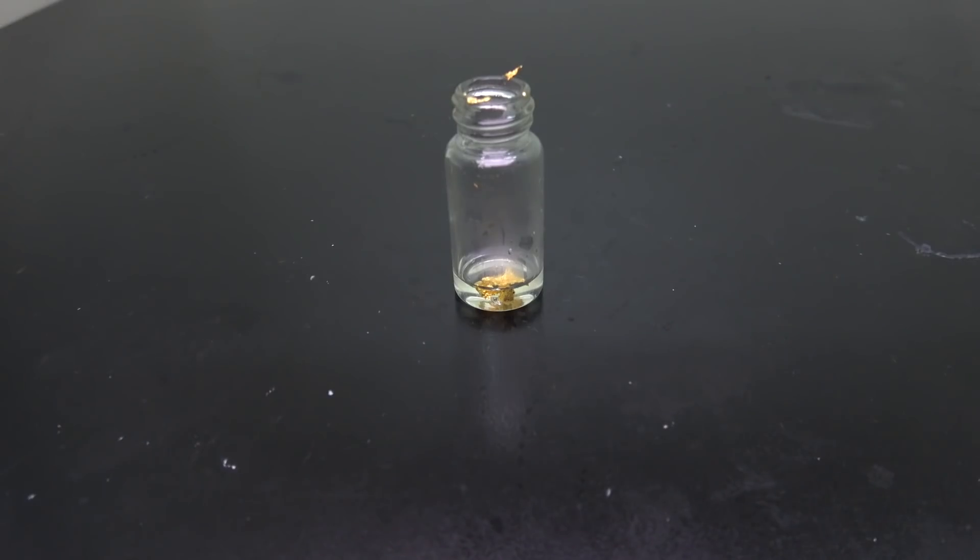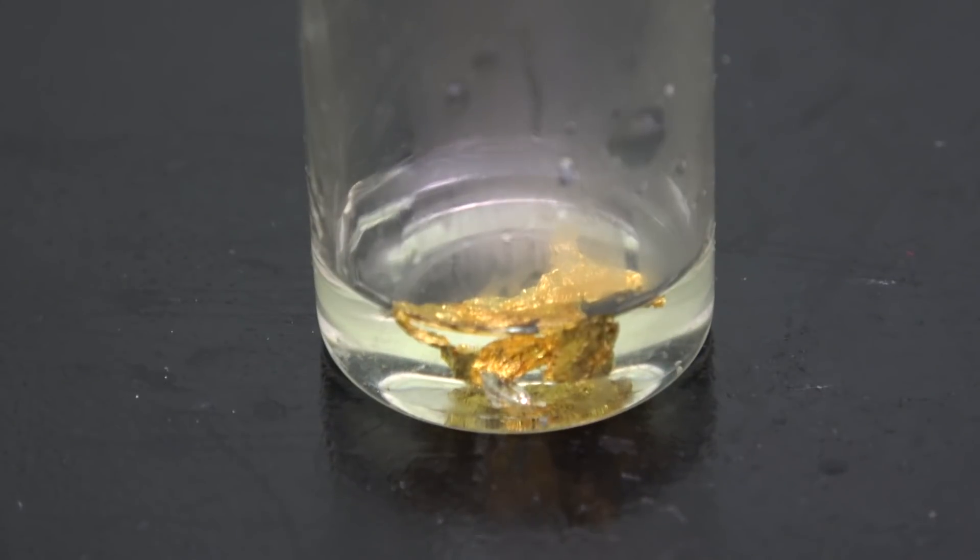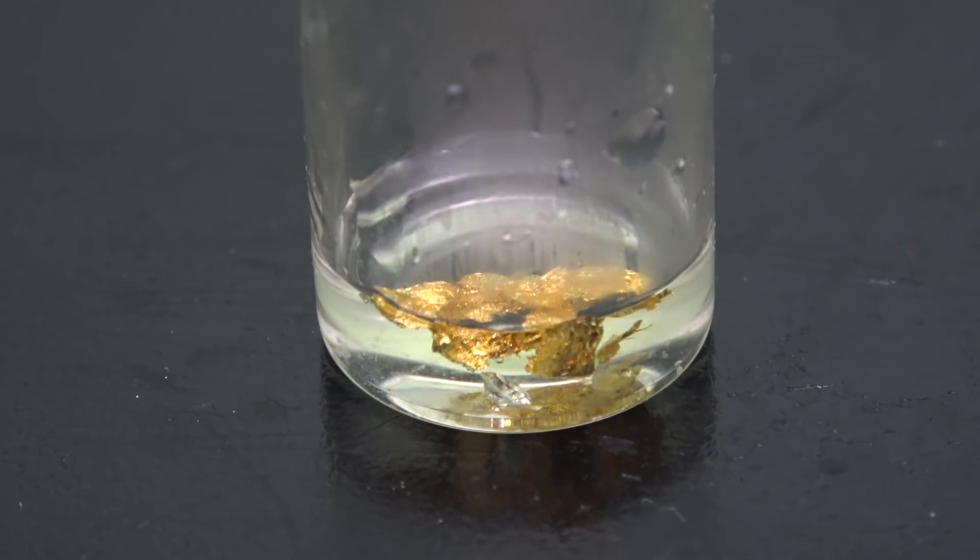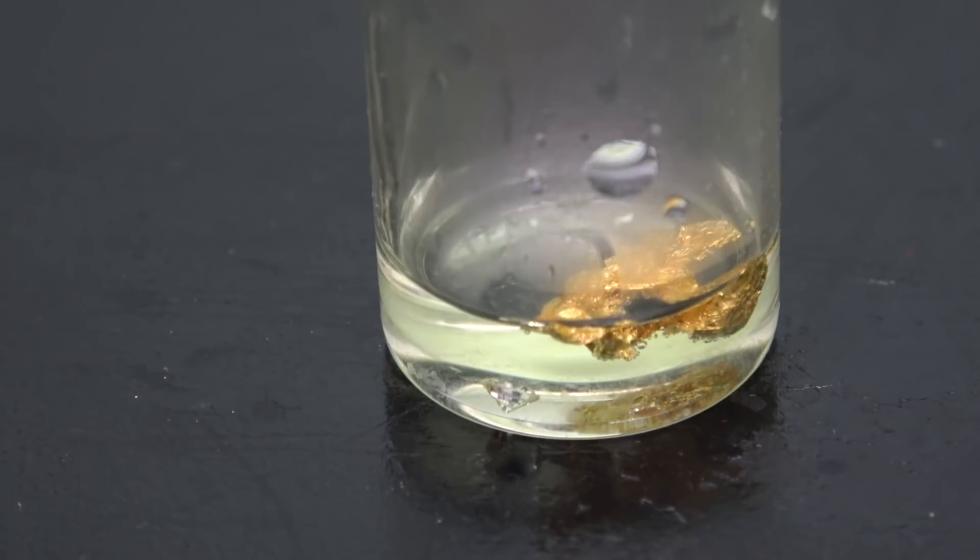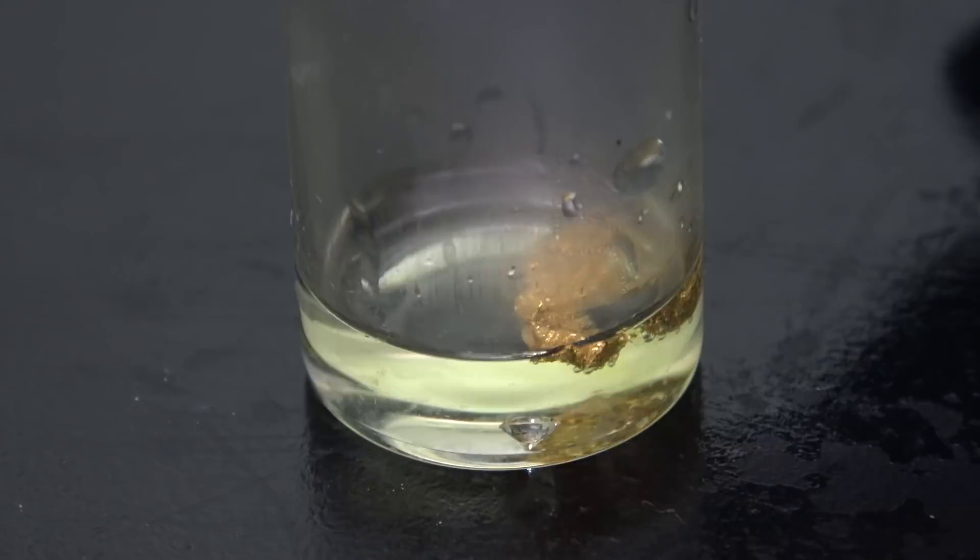And as you can see, hydrochloric acid alone is incapable of dissolving gold. Not until I add a few drops of nitric acid. Soon there are bubbles that appear on the surface of gold and the solution is gradually turning yellow.